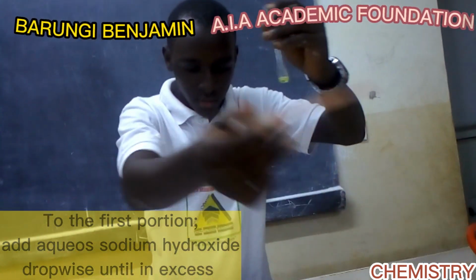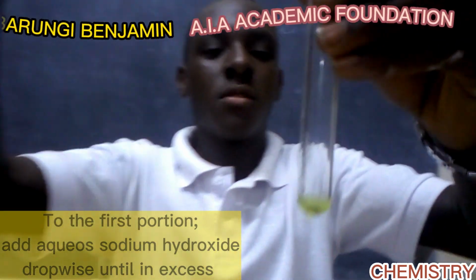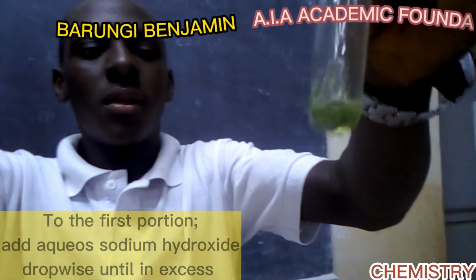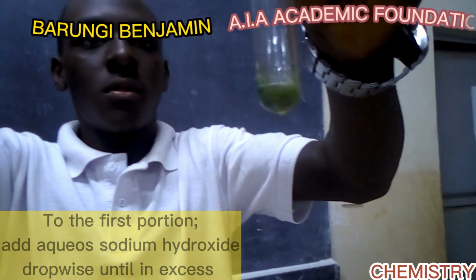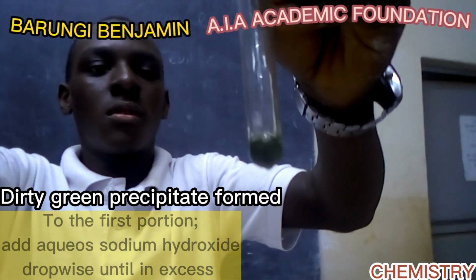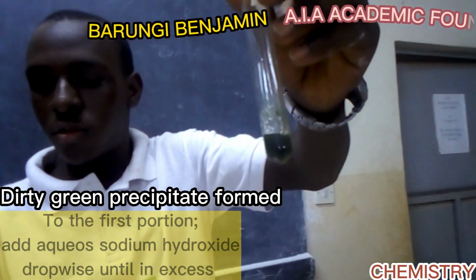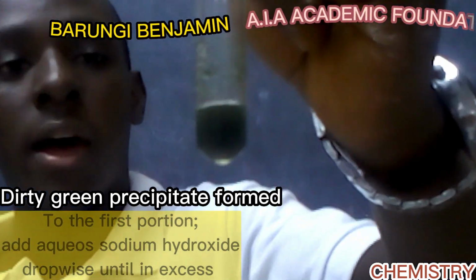They have said dropwise until in excess. So that's our first drop. You can see as we are dropping, there is a darker green forming. The darker green is insoluble in excess sodium hydroxide. So this proves to you that the iron 3 ions have been reduced to iron 2 ions.